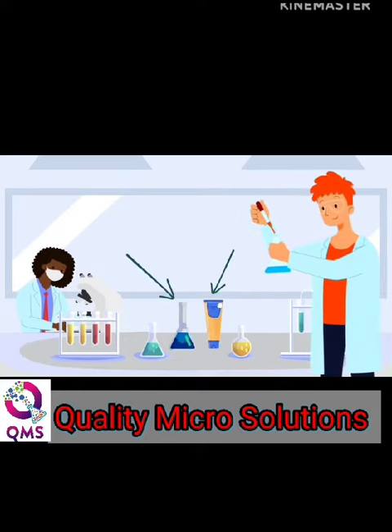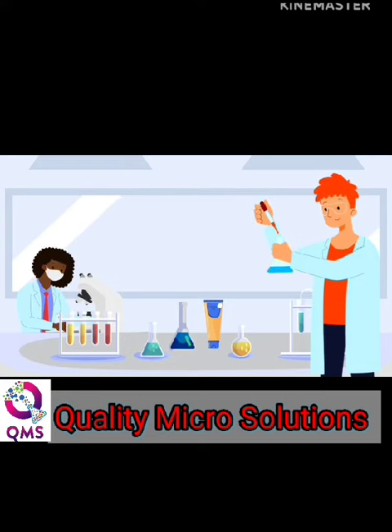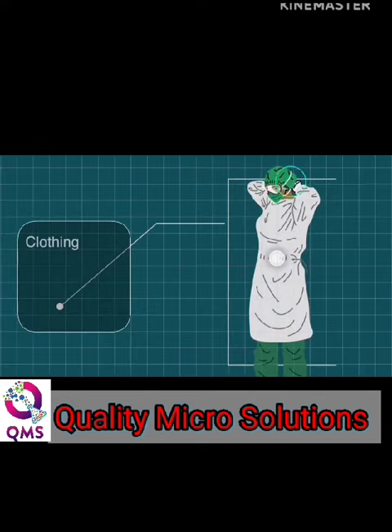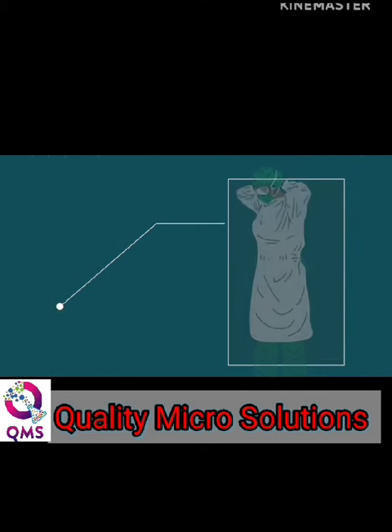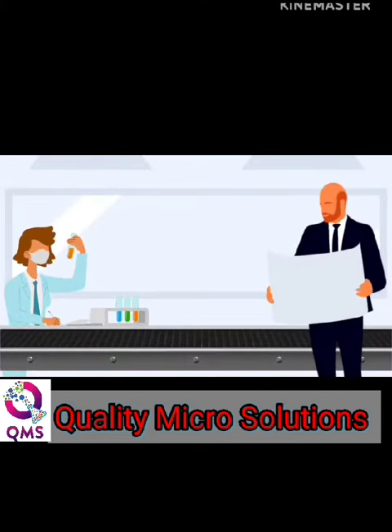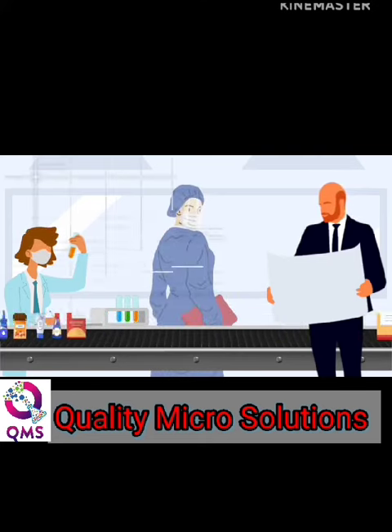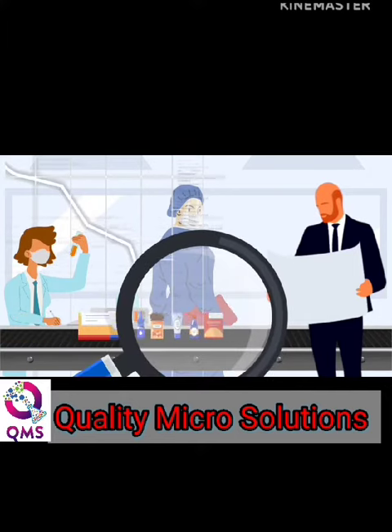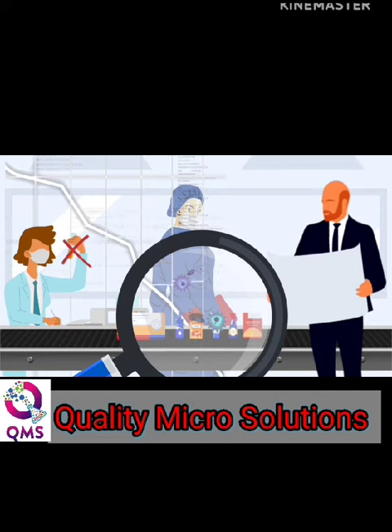Water, product ingredients, and even the air itself can be taken as samples and tested for microbial contamination. Workers' clothing, gloves, and masks must also be tested for bacteria. Most organizations already have practices in place that are compliant with FDA and CDC standards. Moreover, things can always go wrong when adapting testing intervals, and even the smallest mistake during the investigation of a bacterial source could shut down manufacturing lines.